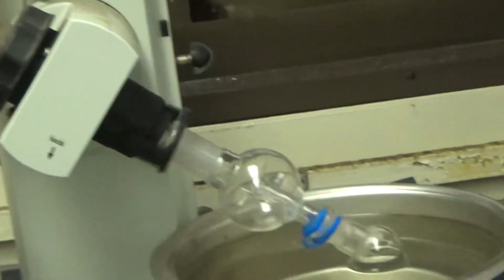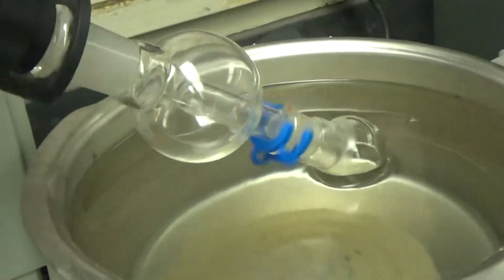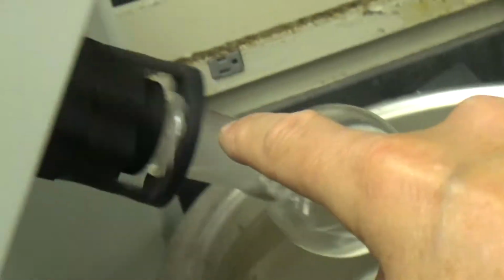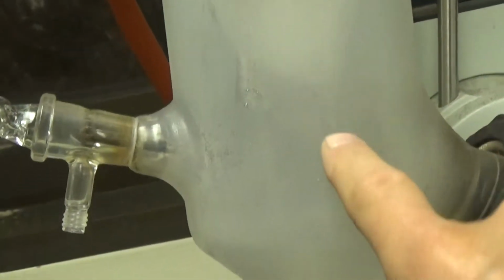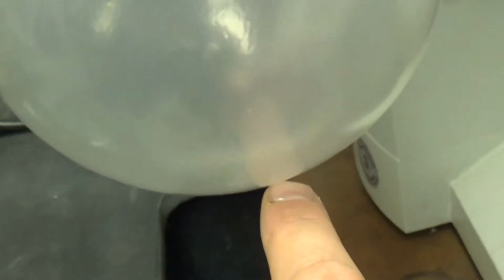And now what's happening to your solvent? Where's it going? It's boiling out of here, and as a vapor it comes up and touches the dry ice, and then it drips into the receiving flask. Do we see any yet? I can check.